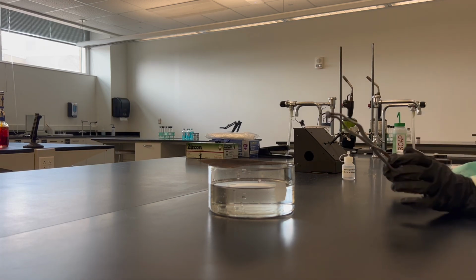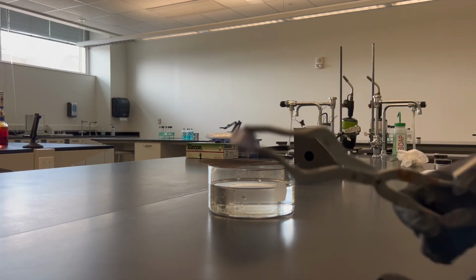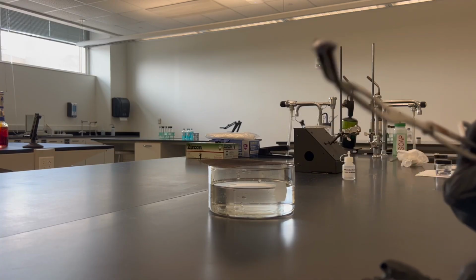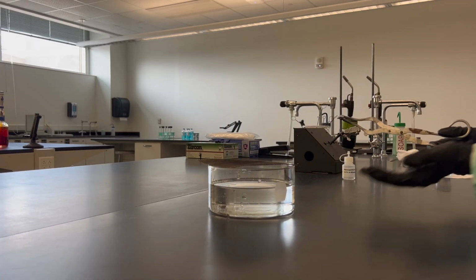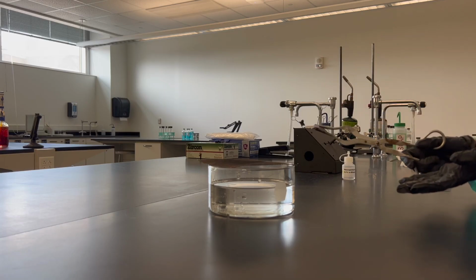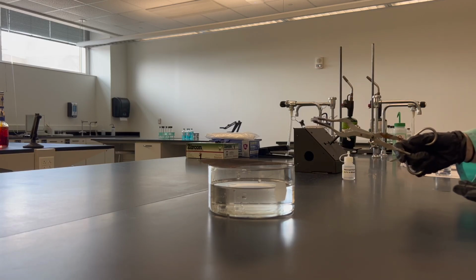Next up, we have potassium. This is potassium. Again, it's just solid elemental, almost has a purplish hue to it. And again, in my beaker, I have water and phenolphthalein so you can see the reaction.